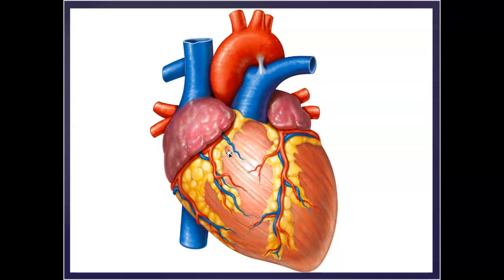Circumflex artery. Circum means around, and flex means to bend, so it bends around. It kind of comes around the back of the heart. Okay, so those are kind of the big ones there.